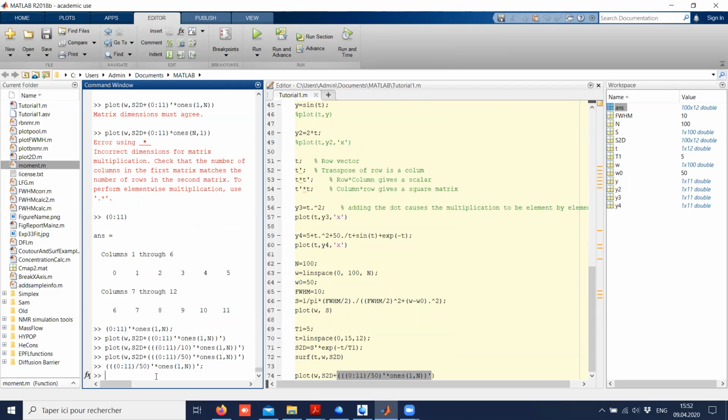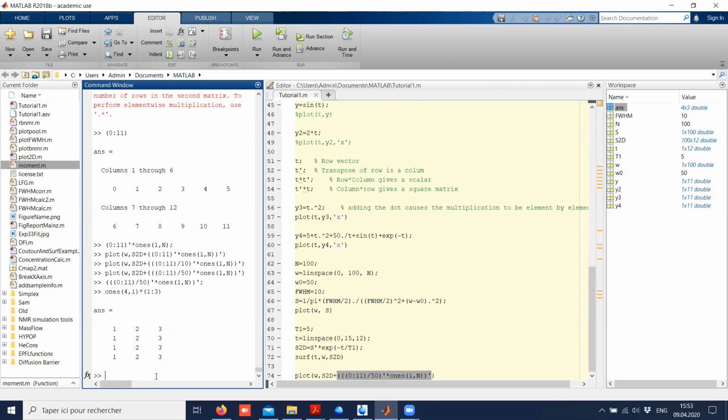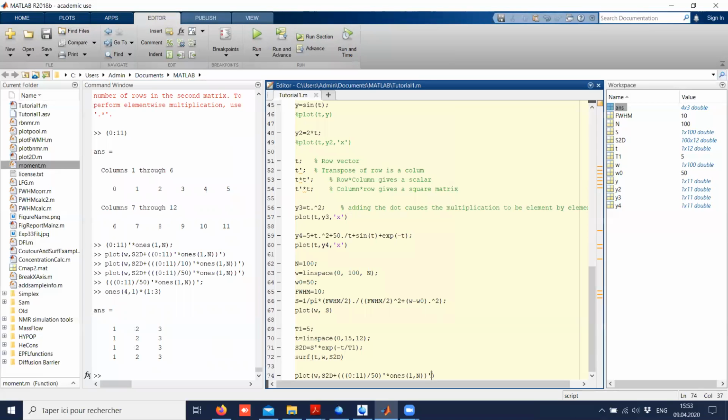And then basically what I did here, if I show you, I should have written it like this, in fact. I will construct a smaller example. This is what I wanted to do. Now it's a bit clearer written in this way. So if I want to write my example in a clearer way, I should write it like this.